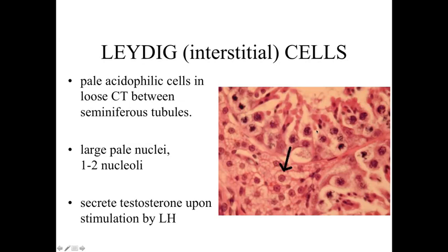Outside of the seminiferous tubules, in between the seminiferous tubules in the loose connective tissue, are going to be these large, pale, slightly eosinophilic cells — these are the Leydig cells. They're a relatively large cell with pale nuclei, maybe one or two nuclei present. It's these cells that respond to luteinizing hormone and secrete testosterone. Testosterone is important because it stimulates and maintains the activity of the cells within the seminiferous tubules, as well as all of the other duct cells within the male reproductive tract, and also has an androgenizing effect on the body. It's an anabolic steroid with a lot of effects. Without testosterone, you're not going to have a functioning male reproductive tract.